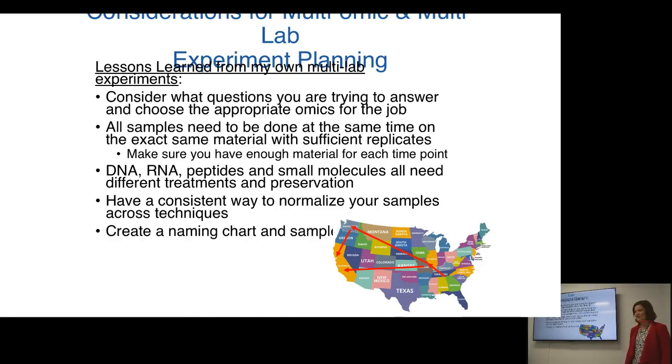And finally, is just a very simple thing, creating a naming chart and having a sample tracker can save you a lot of headaches when you're coordinating across many labs and people and states.